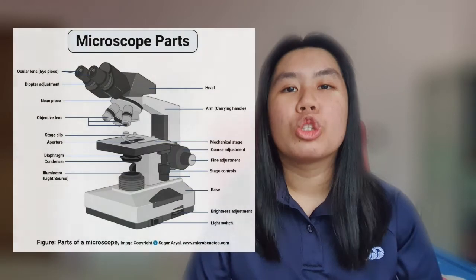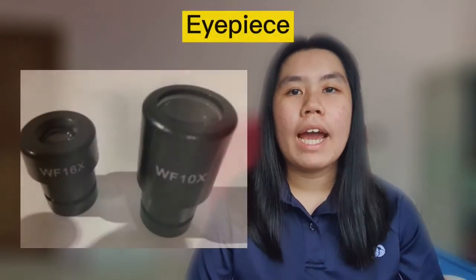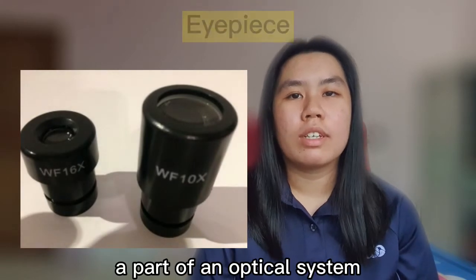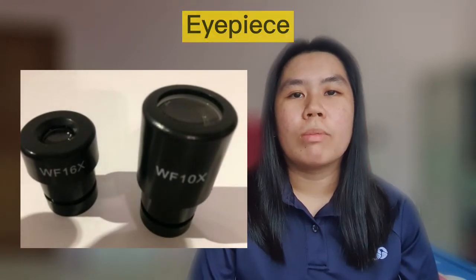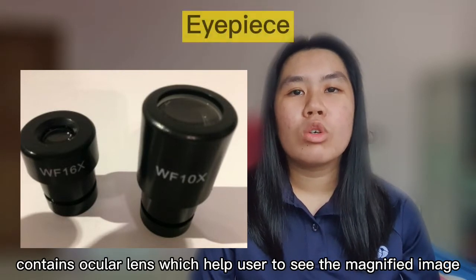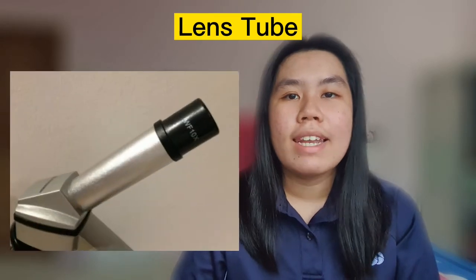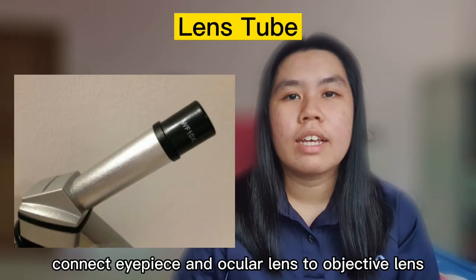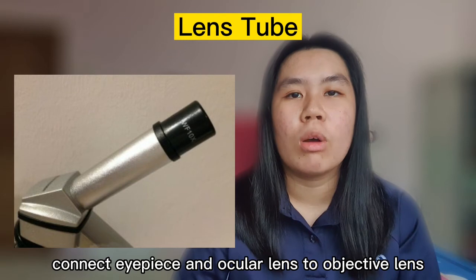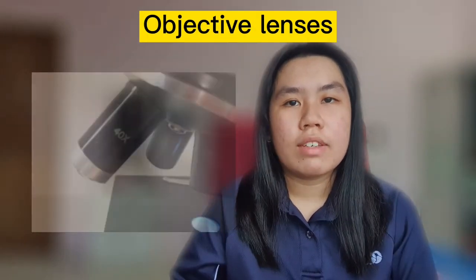Now, I'm going to talk about the function of each part of microscope. First, eyepiece. Eyepiece is a part of an optical system which is directed to the user of the microscope. It contains the ocular lens which user looks through to see the magnified specimen. Next is lens tube. Lens tube holds the eyepiece and connects eyepiece and ocular lens to the objective lenses which are near the microscope stage.